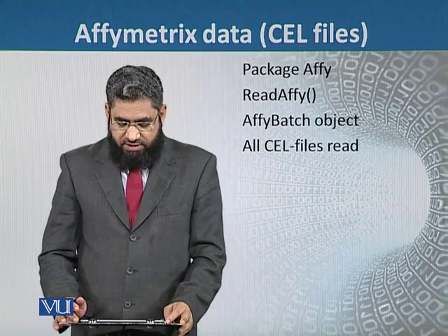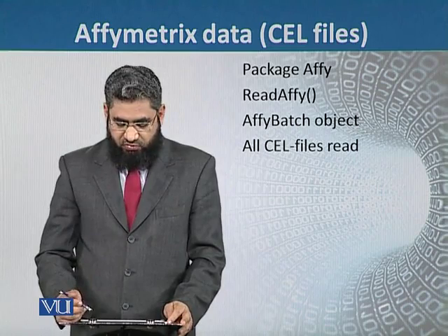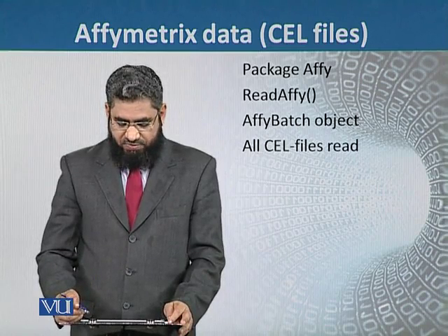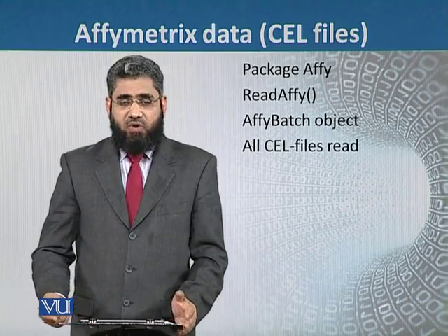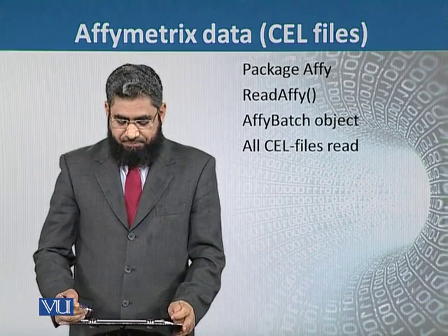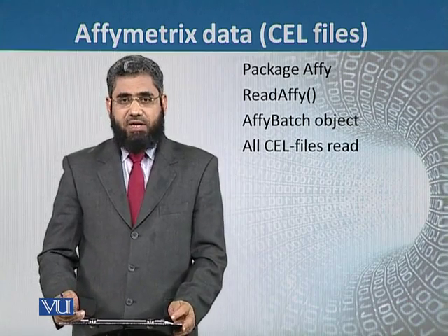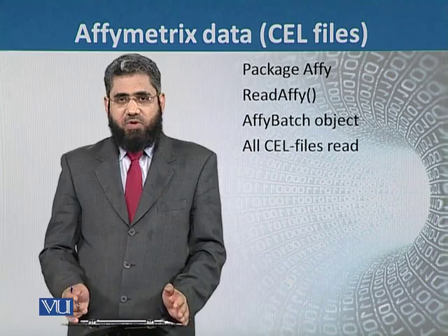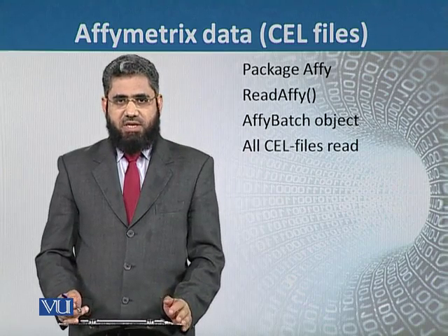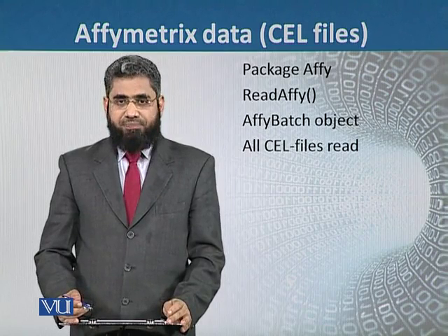The data that is imported is saved in the form of an AffyBatch object. When we apply the ReadAffy command, all of the CEL files, which are generated with Affymetrix, will be read.